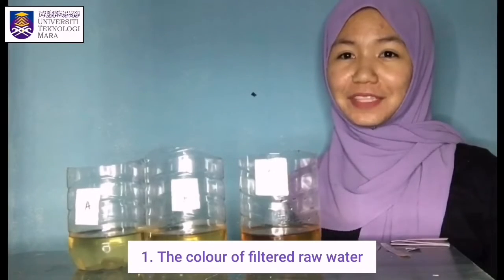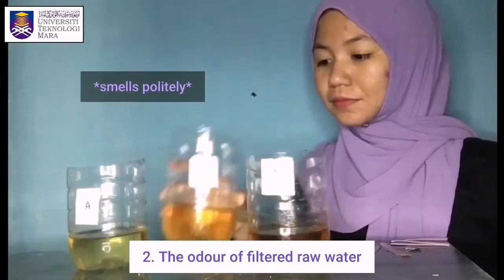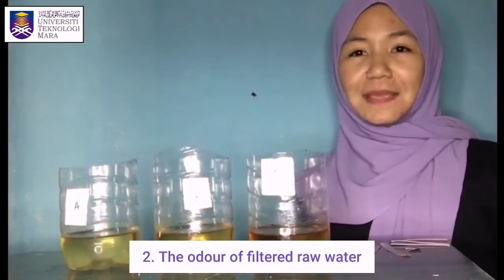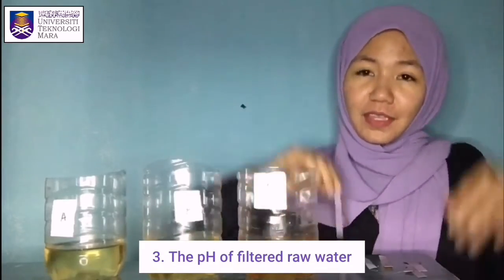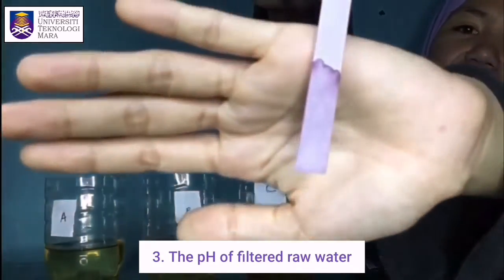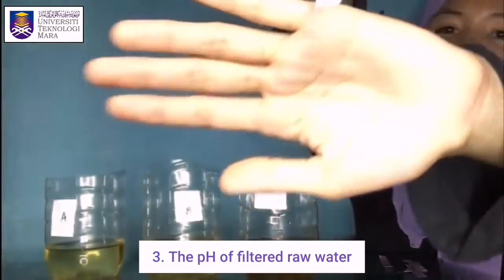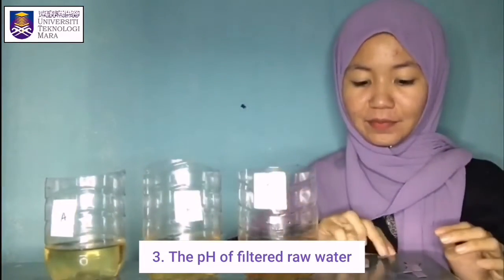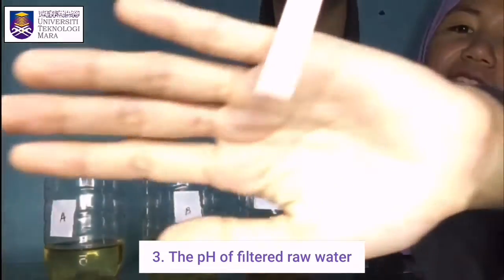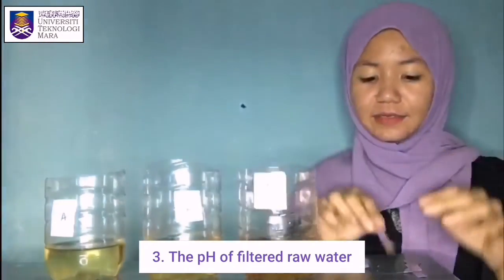The next parameter for this experiment is the odor of the sample. The sample is odorless. The third parameter for this experiment is the pH of the water. If the litmus paper has no change, it is neutral. If the litmus paper turns to blue, it is alkali. If the litmus paper change to the red, it is acid.